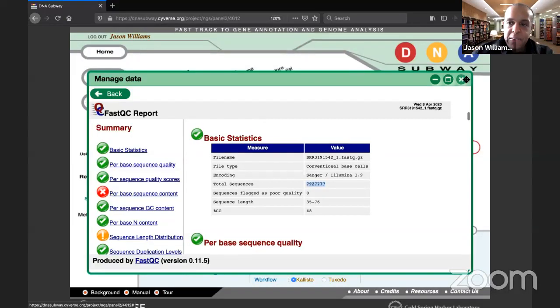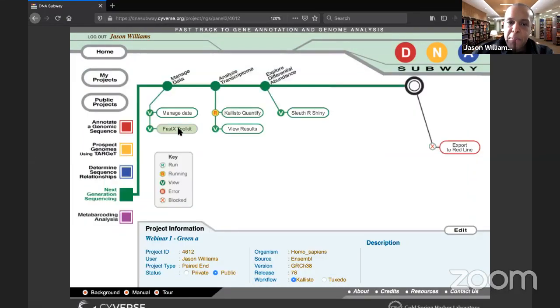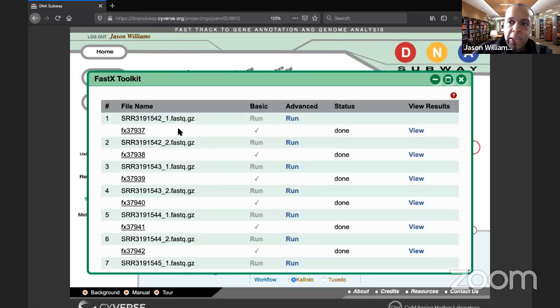But slightly different. If you had poor quality sequence, it's much more important to use the FastX Toolkit, but you can skip it if the sequence quality is good. And a little hint that I haven't really written in a slide is that the method that we're using, Kallisto, is really good and robust to sequencing error. So even there you get a little bit of a boost that way.